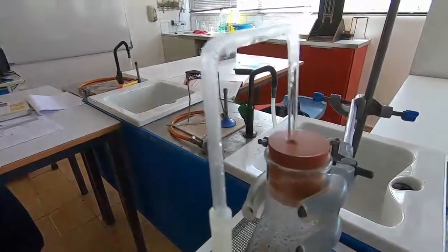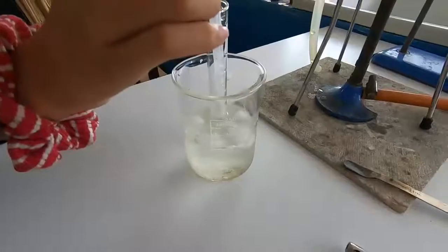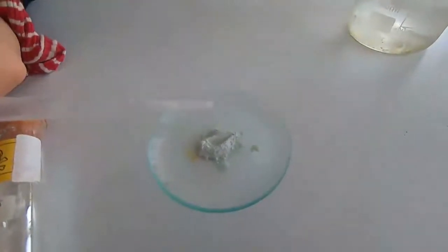We just leave this running for a minute or two until we've got enough to collect. Then we test it with anhydrous copper sulphate. This white powder is anhydrous copper sulphate, and we're just going to test a few drops of our product with it.